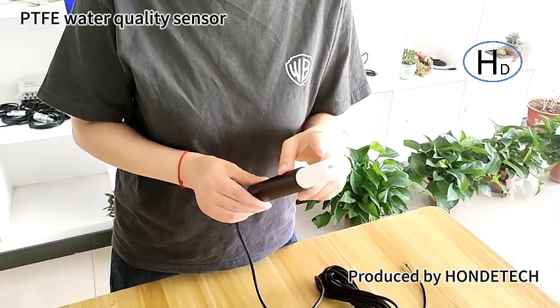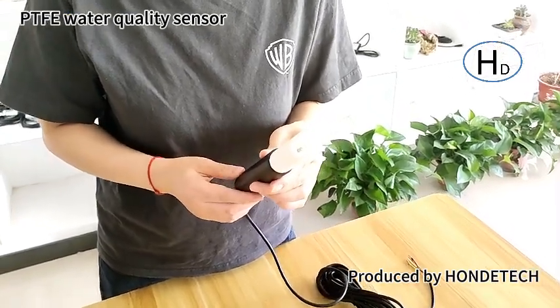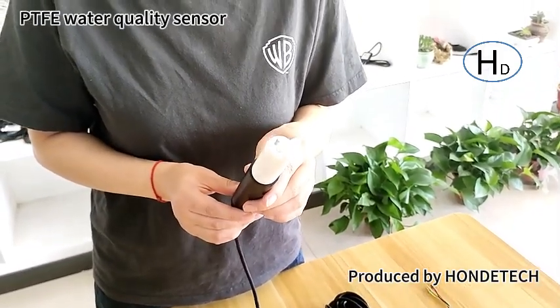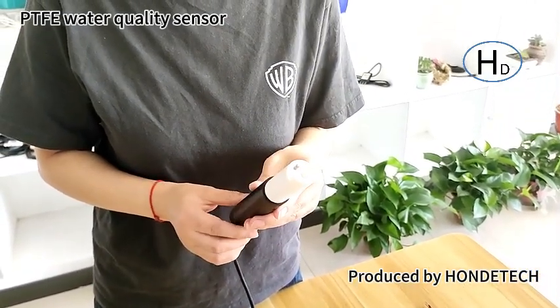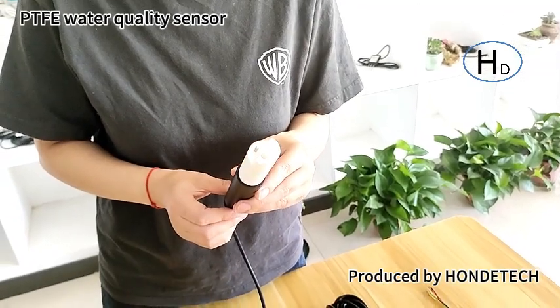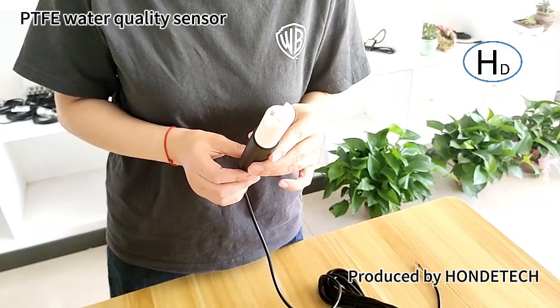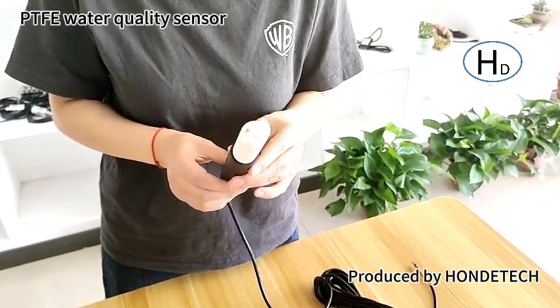It can test EC, temperature, TDS, and salinity at the same time, and its measurement range is very high. It can be 0 to 200 mS/cm, so it can be used in high measurement range applications such as sea water, salt water, and aquaculture.